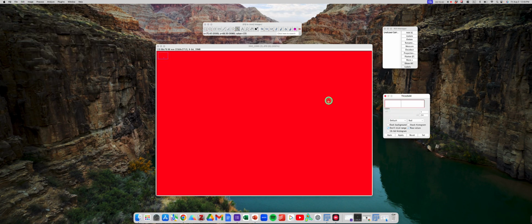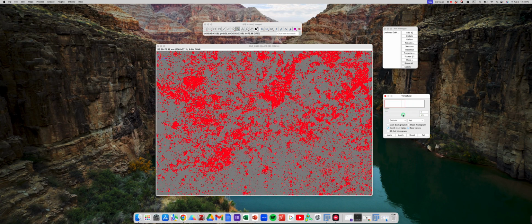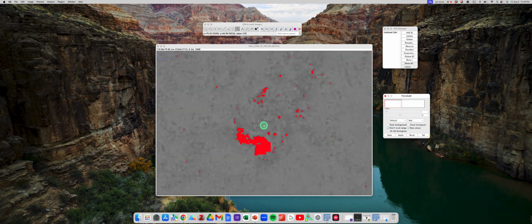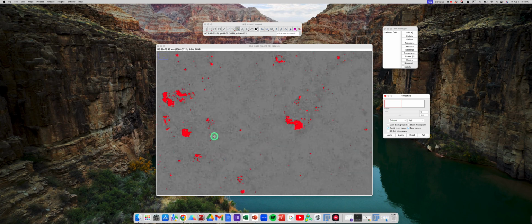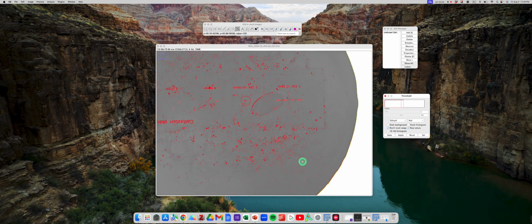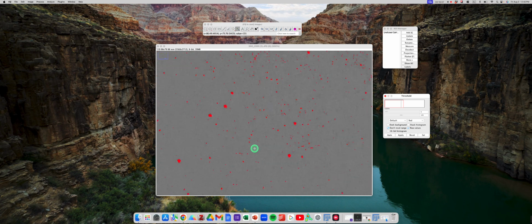And we are way over thresholded. So let's pull that down. And then in this case, you're going to have to zoom in a lot. These are obviously individual microspheres, but it should look like powder. So let's continue to adjust this. I think that's fairly good.